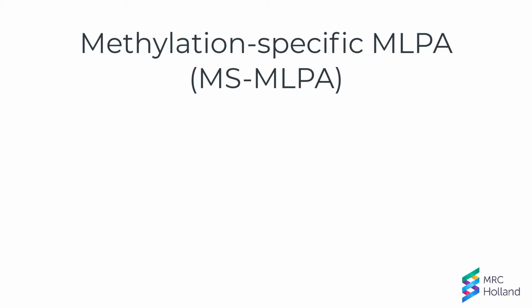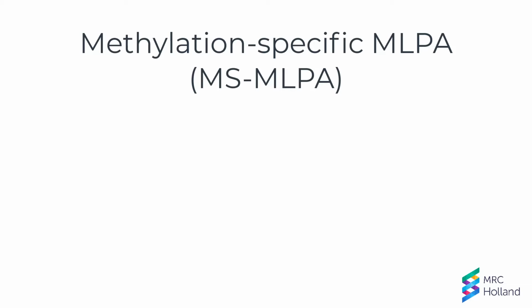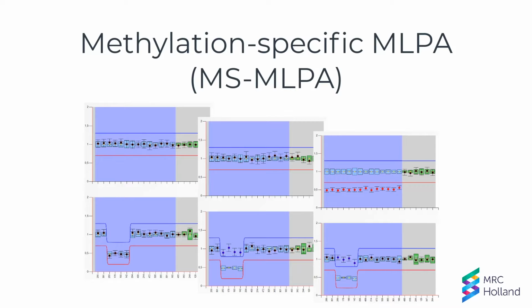Methylation-specific MLPA, or MS-MLPA, is an adaptation of the targeted MLPA technology and combines CNV detection with DNA methylation profiling. In this video, typical MS-MLPA results are shown, and I will explain how they can be interpreted.